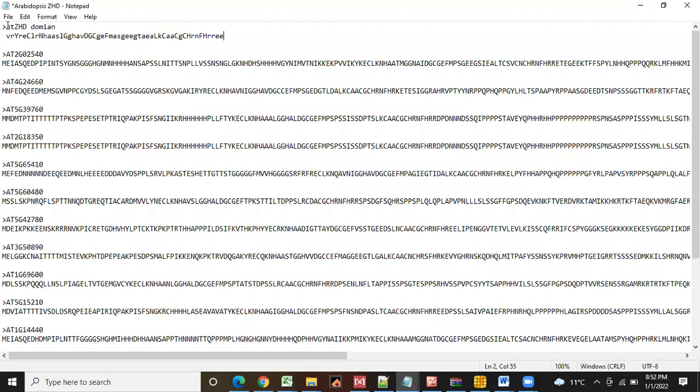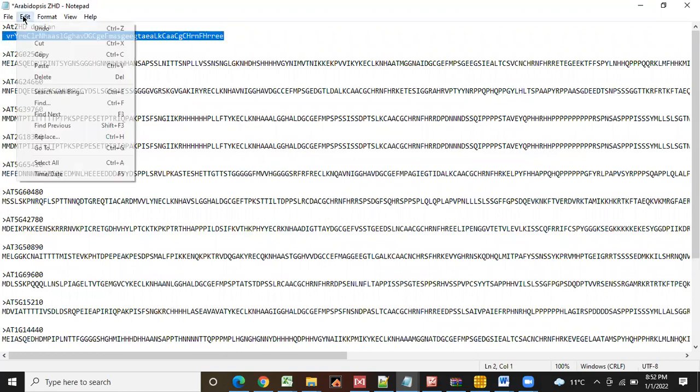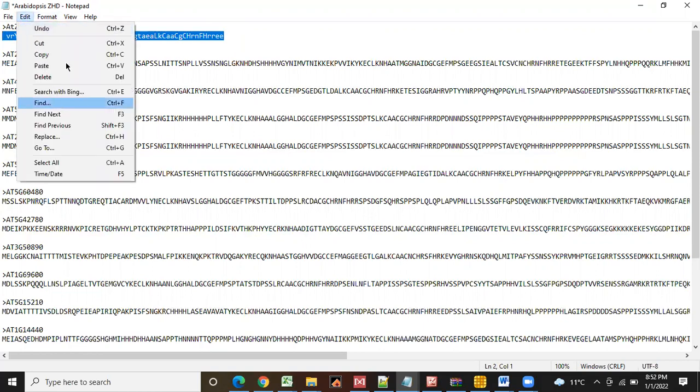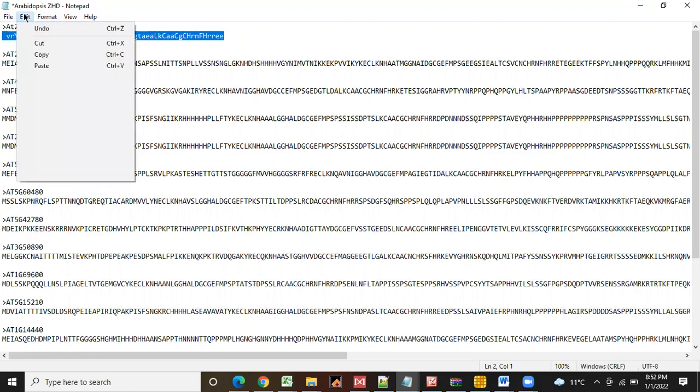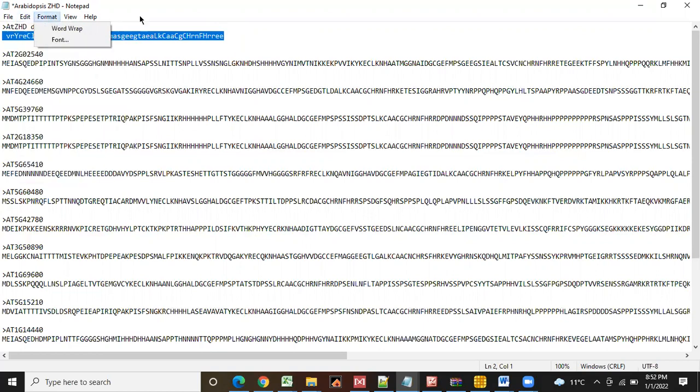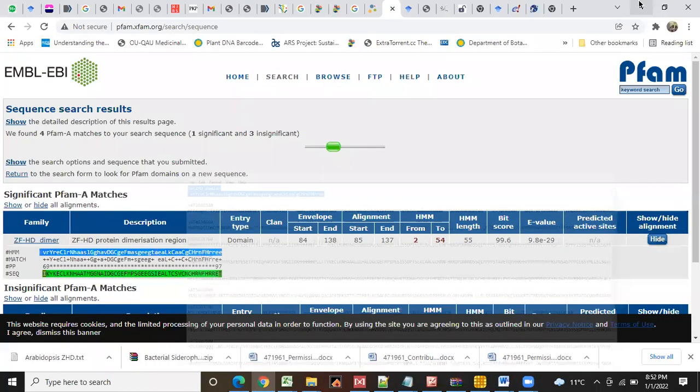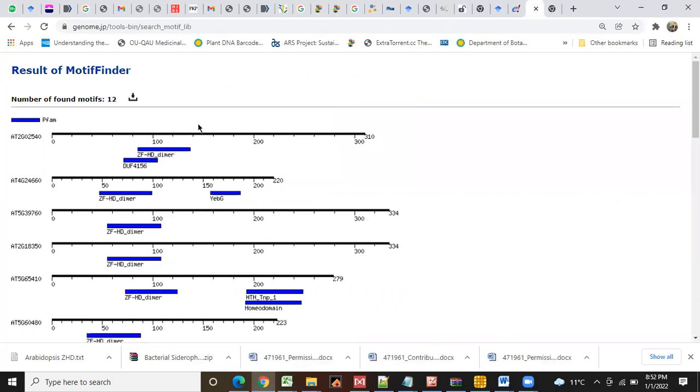We will keep it here so that in the future we should know what are the sequences that we used. And then we will copy this, find all the genes that contain ZFHD from Ensemble Plant database.